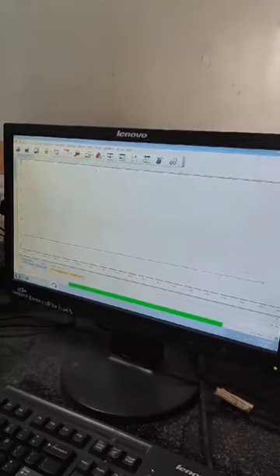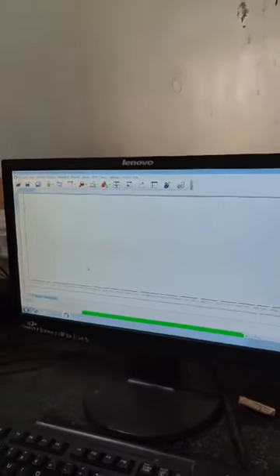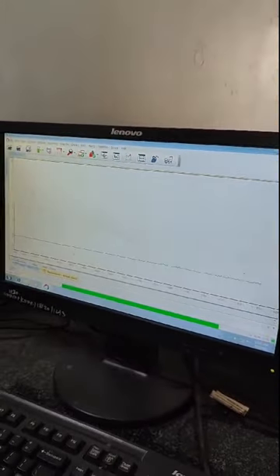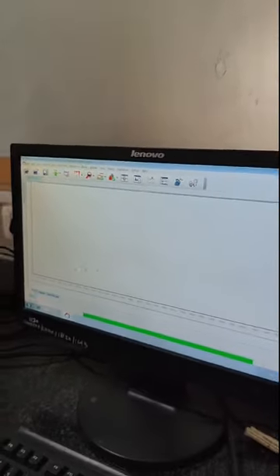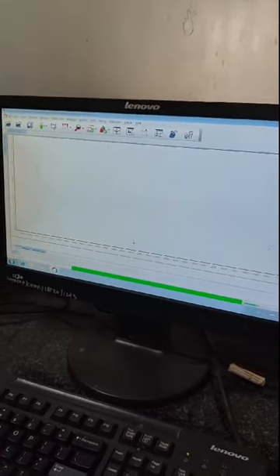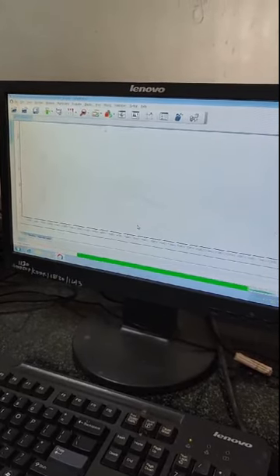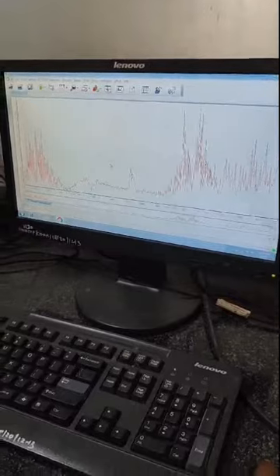We will get the FTIR graph. After clicking 'Start Measurement,' the actual measurement begins. You can see the sample scan progress in percentage. We will get the FTIR spectrum. Options are available to take either absorbance or transmittance. Here this is absorbance, but we can also take it as transmittance.